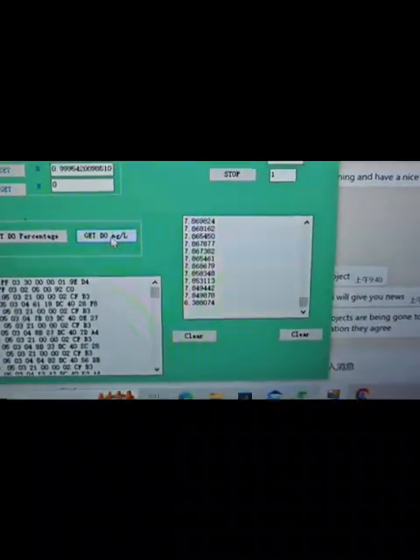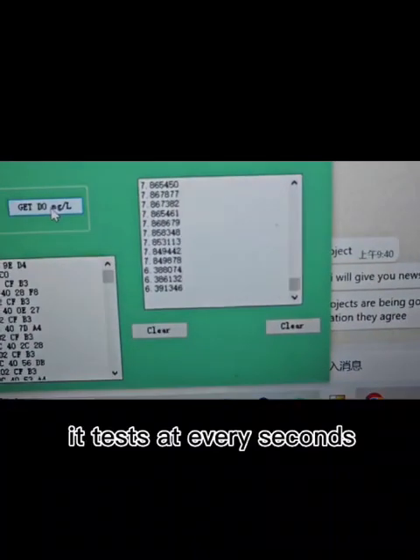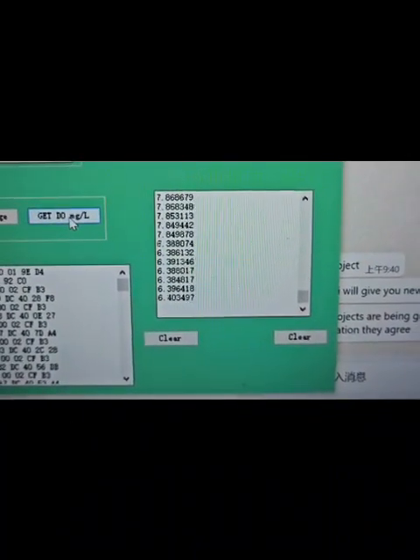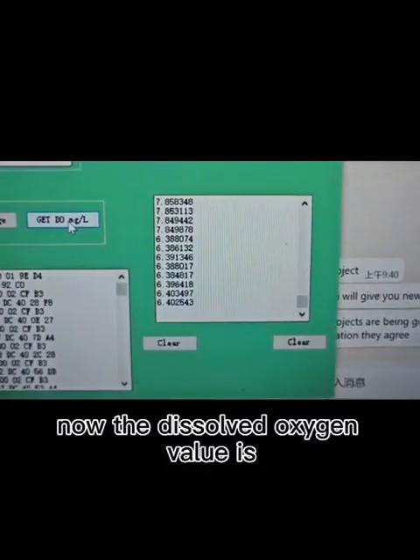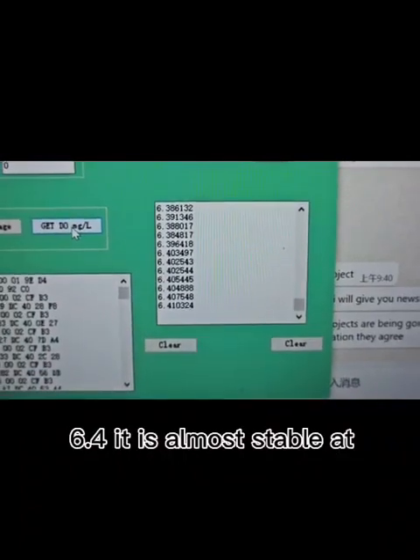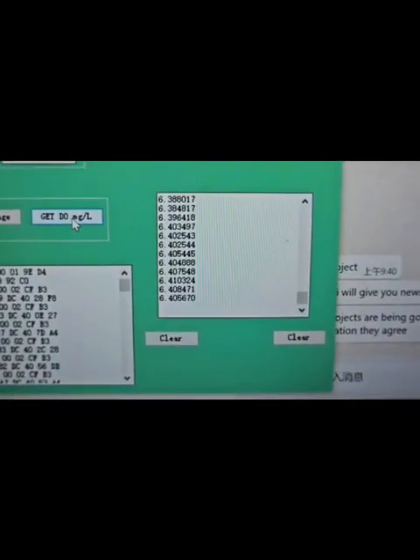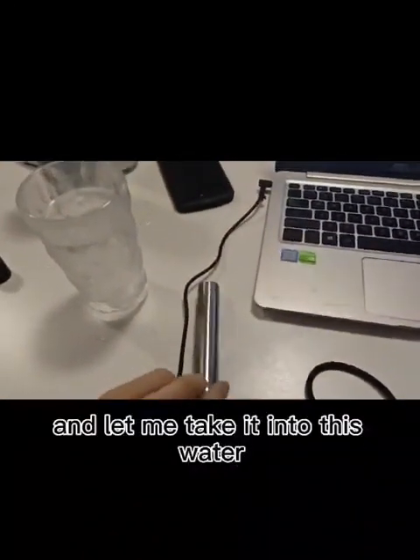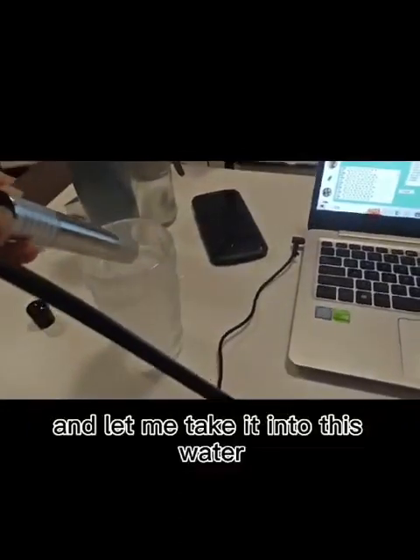Now let's see it. It tests at every second. Now the dissolved oxygen value is 6.4. It is almost stable at 6.4. Now it is in the air — let me take it into this water.